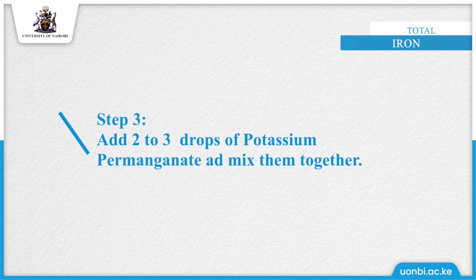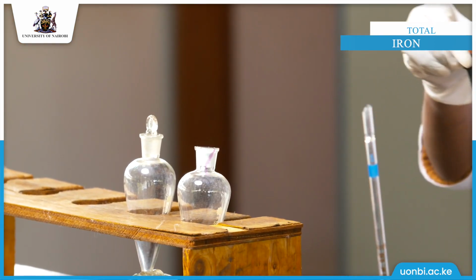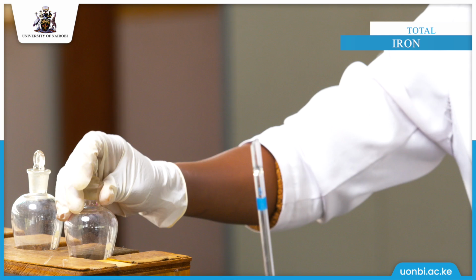Then 2 drops of potassium permanganate. Then we mix.